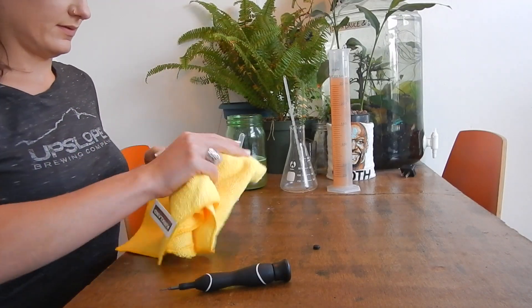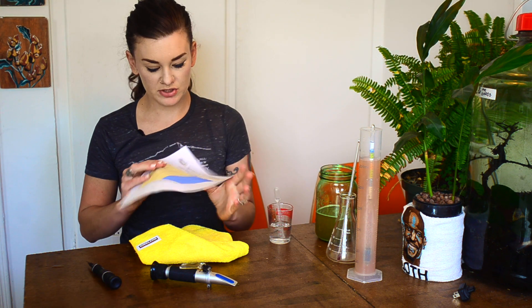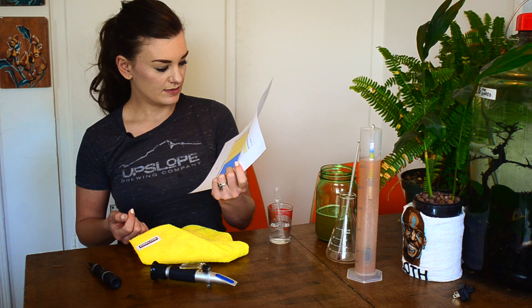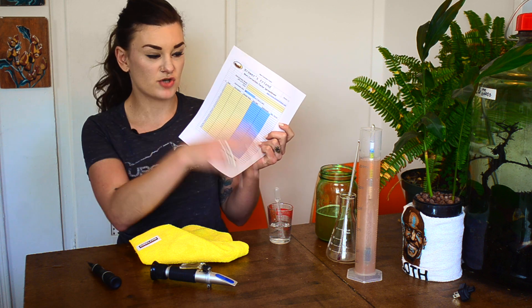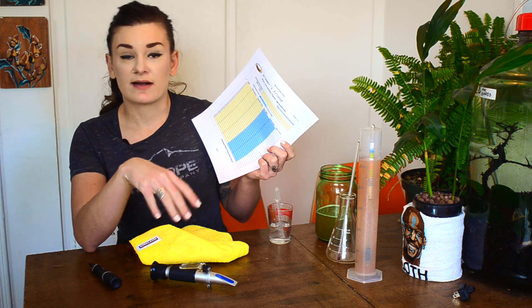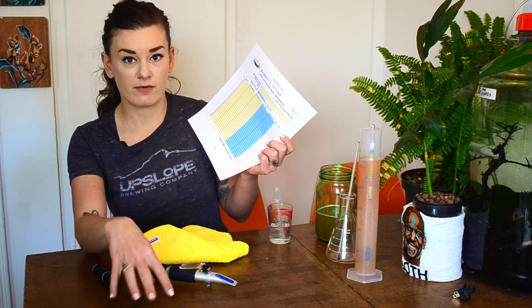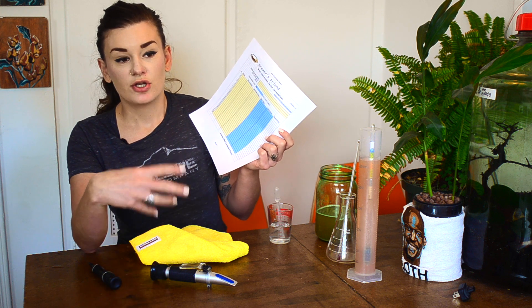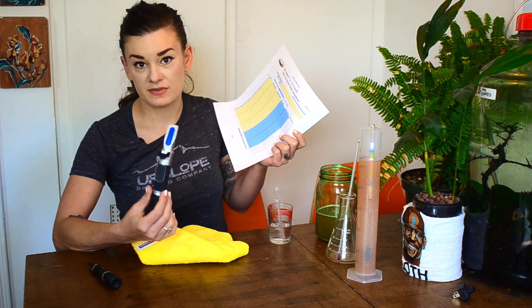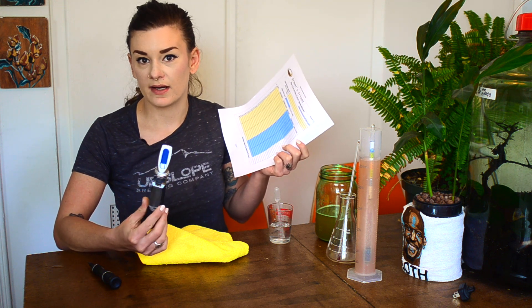Dry off the refractometer and put the cap back on the screw. You can use it the same way you use a hydrometer, except you need to get your wort correction factor first. You'll need to fill out the wort correction chart on Brewer's Friends — that's how I calibrated mine when I first got it. You take 30 different gravity readings with both the hydrometer and refractometer and it averages them to give you a correction number for use in online calculators. This thing was made for fruit juice, not wort, so you have to fiddle with it a bit, but it's totally worth it.